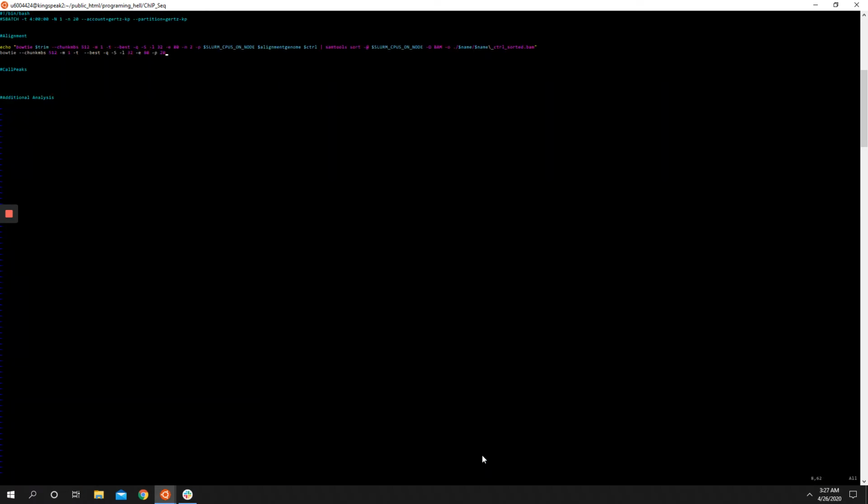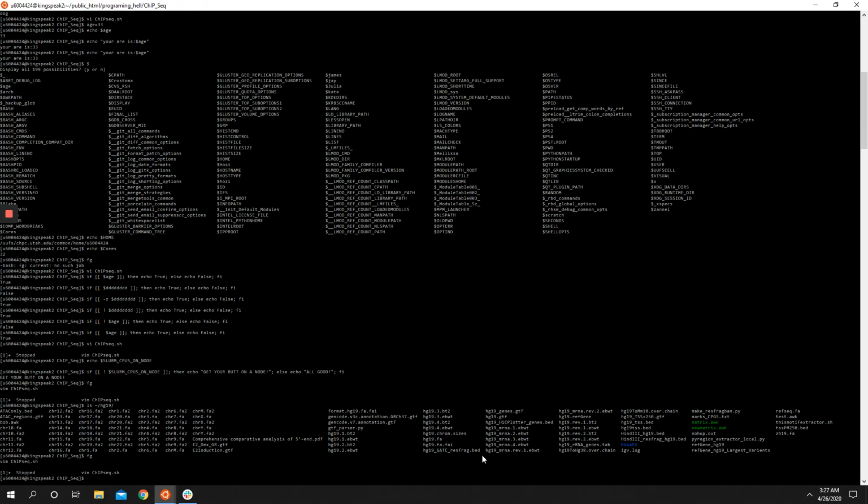Okay, so for us just spitting out the program the first time, we would have just typed, let's give it the full path here. If you want the full path to something, you can use the realpath program. So this is what's termed a relative link.